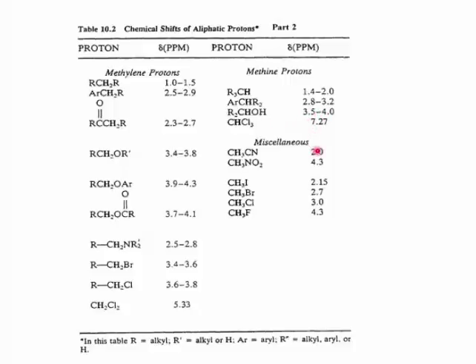Here are some miscellaneous entries for methyl groups. In each of these cases, methyl is attached to a fairly strong electron withdrawing group, giving chemical shifts that are relatively high in value.